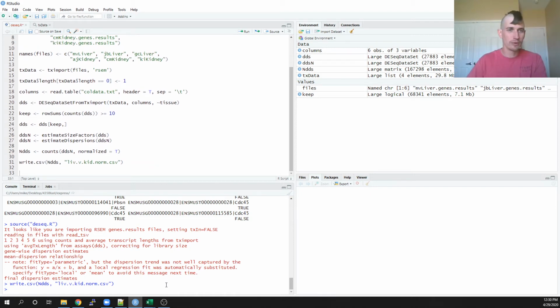All right, so now I am actually ready to do my differential gene expression. So basically, what's happening? I'll just run DESeq. It really doesn't take that long to run. It's just DESeq and then the DDS file, right? So it's the non-transformed data. Again, this function will just go ahead and transform everything for me and then run my experiments.